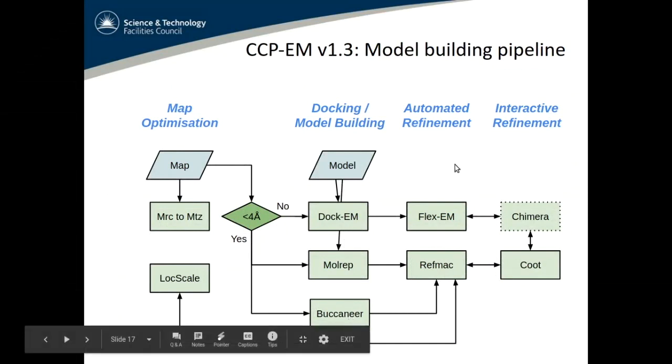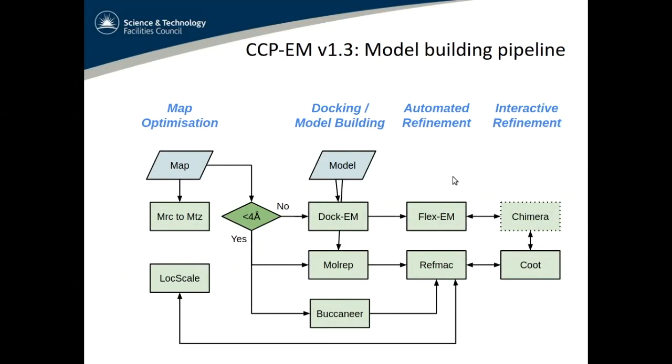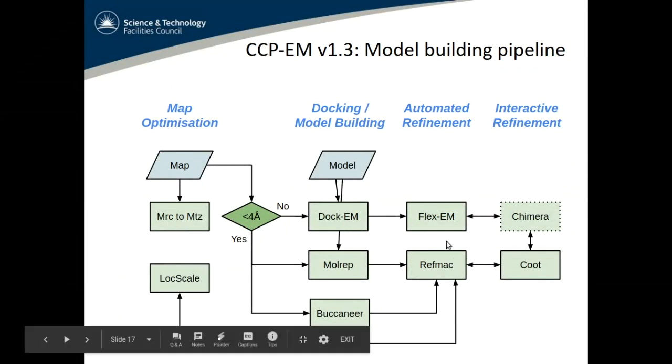Once you've got your model docked, you then need to refine it, so make it fit better into the map in a more flexible way rather than just a rigid fit. And for that, at medium resolutions, you have FlexEM, and at high resolution, you have REFMAC. Again, I'll go over both of those later.